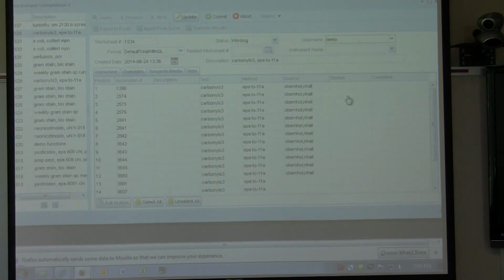This is a perfect time. It's going to save you a bit of time, quite a bit of time, I'm hoping, and reduce your cut and paste process. So it's just a perfect time if you can do it, and that's what the push is from Mike to do this.